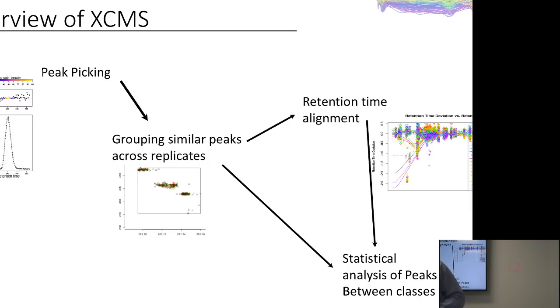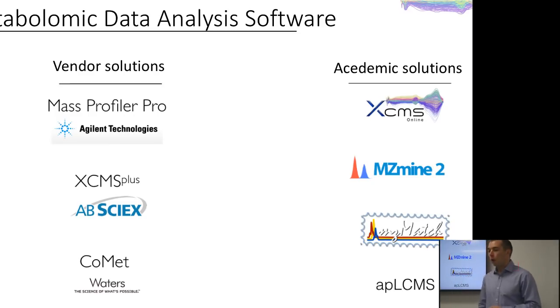Finally, we'll go off and do some statistical analysis. Now, both myself and the other presenters are going to be talking very heavily about XCMS itself today. There are other platforms out there, whether it be vendor solutions or academic solutions, whether it be something like MS-Dial or MZmine 2 or MZmatch.